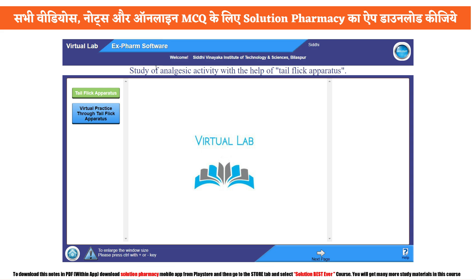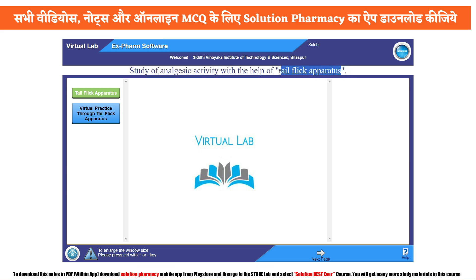That is why we are encouraging the use of such software to understand the concept of any pharmacological experiment. For today's experiment we have to perform analgesic activity tests with the help of tail flick apparatus. First we need to understand the two basic terms: analgesic activity and tail flick apparatus, also called tail flick analgesiometer.